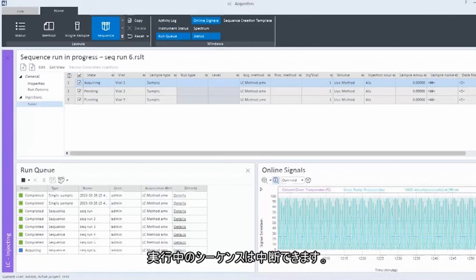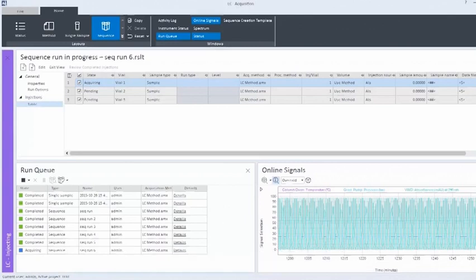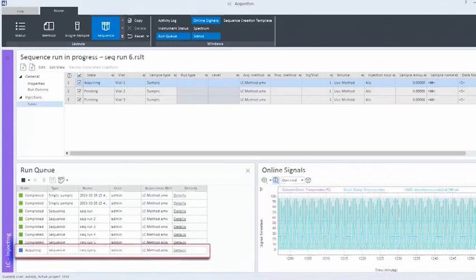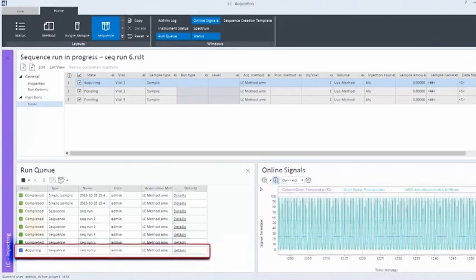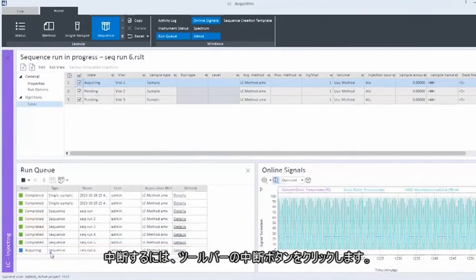You can pause a running sequence. In the run queue, the sequence is in the acquiring state. To pause it, click on the pause button in the toolbar.